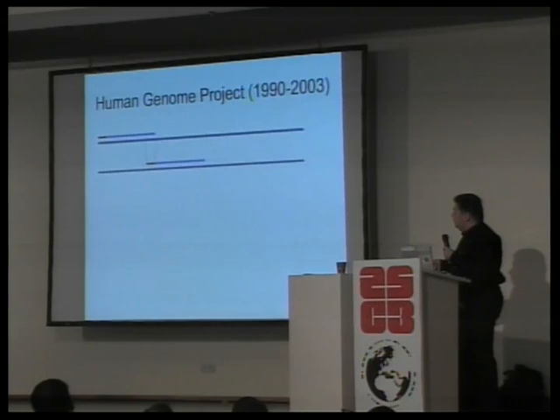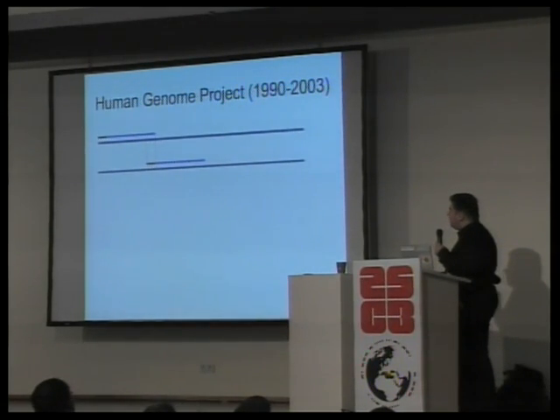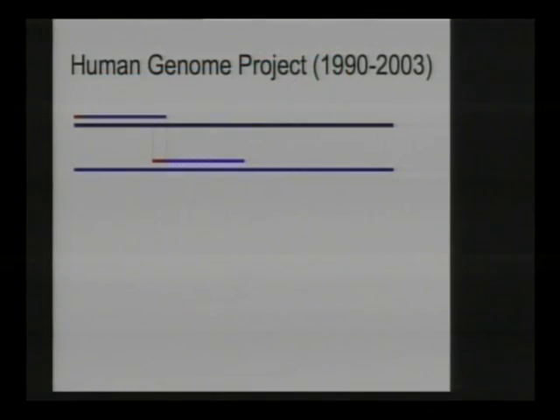Sorry. Because first, you have to wait for this run to complete before you can even think about starting this run, because you don't know this yet. And then you have to wait for this to complete before you can start the next part. The other thing is that you actually need scientists to do this, because you can't just take the end of this and run it. You have to actually look at this whole sequence, and sometimes you have to start a little more early, because bases don't have the right GC content and so on. So this required all highly trained personnel.